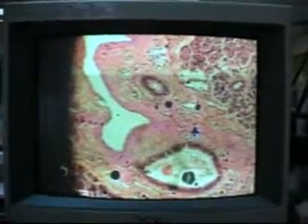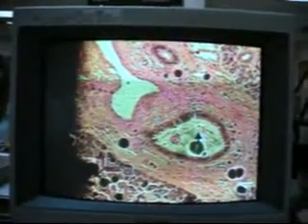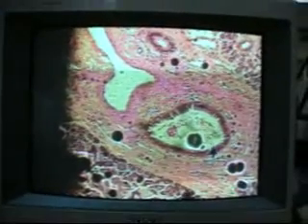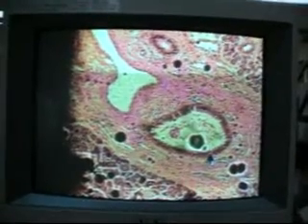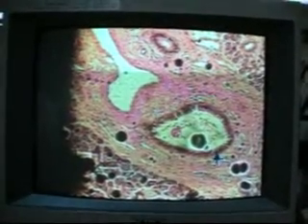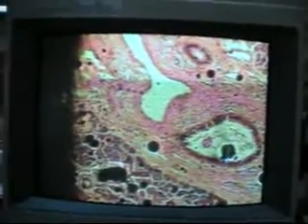Now let's go down and look at the duct, so you can see a little difference in terms of the cell types that are there. It's a little blurry, but you can see that in fact these are certainly not smooth muscle cells, and there's no endothelium there. So when you can see these, it will look very clear to you that these are different cell types, and these are the things that will pass the saliva to the outside, okay?